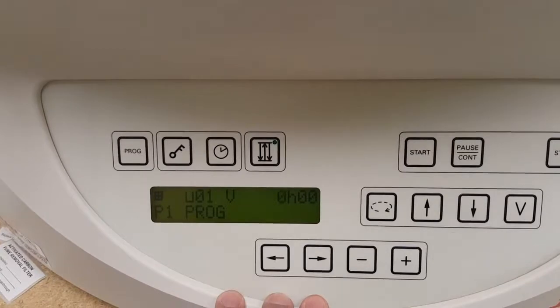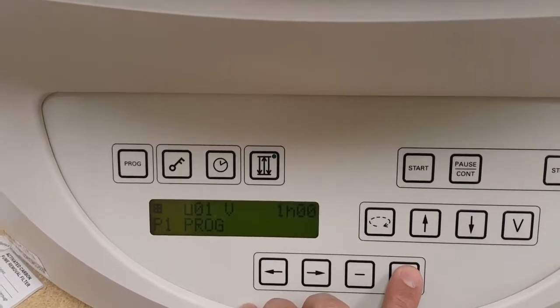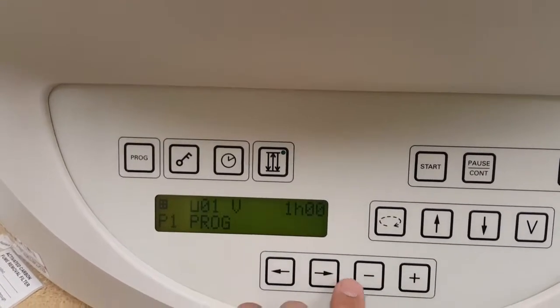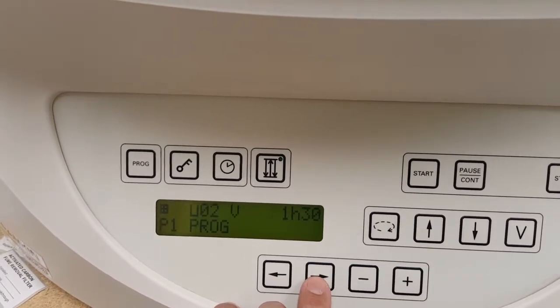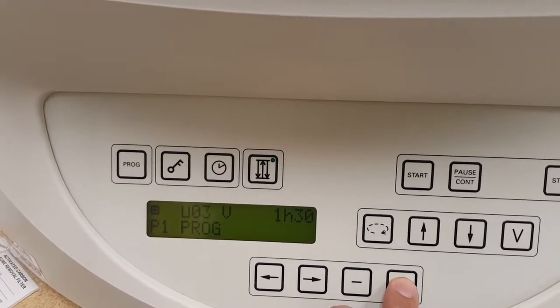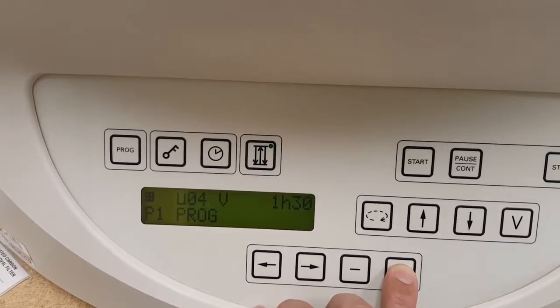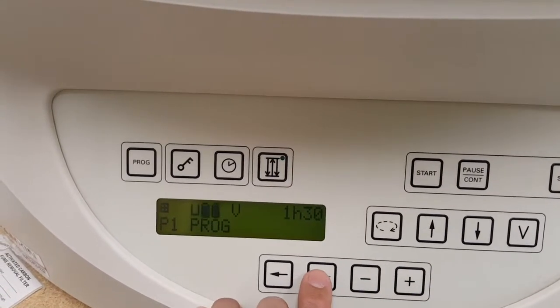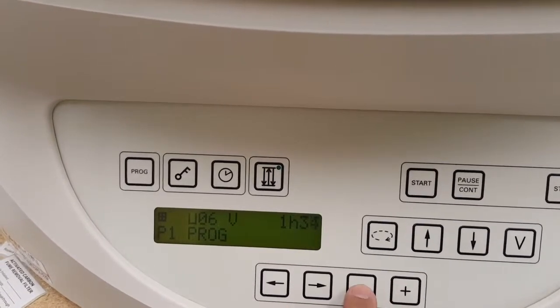Go over to the hour — we're going to program this for one hour. Then you can come back to the next station and program it accordingly: one hour and thirty minutes. Station three, one hour thirty. Station four, one thirty. Station five, one thirty. Station six, let's change it to one twenty.